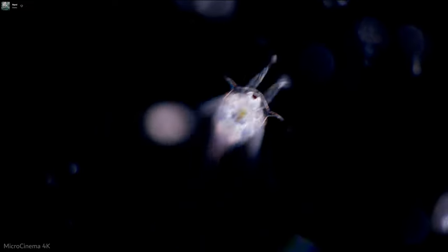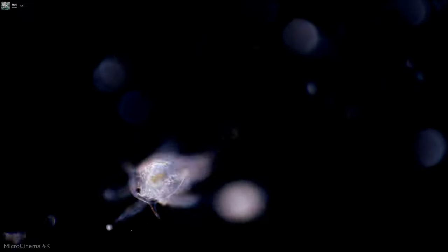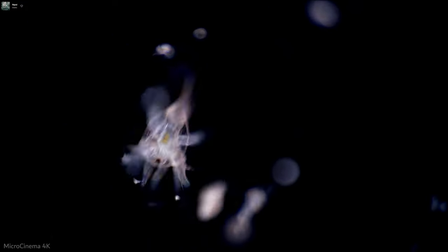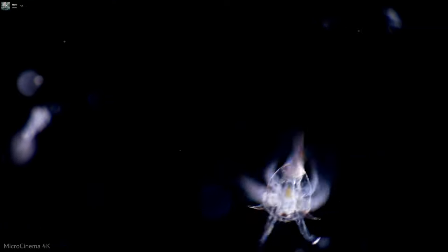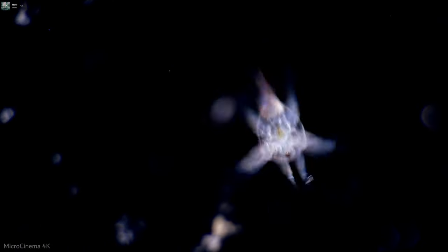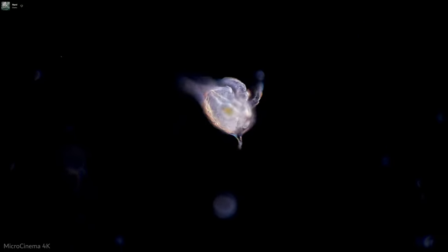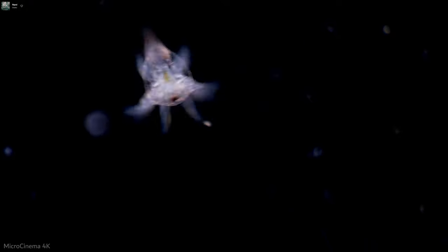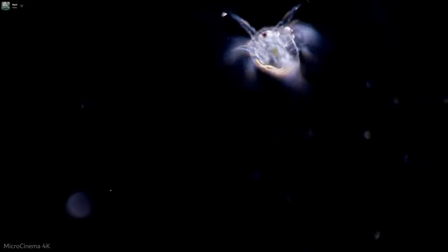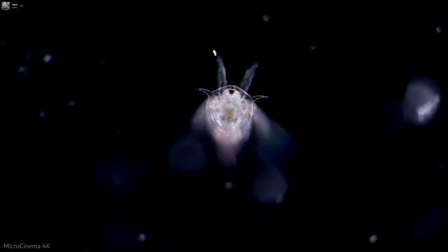And I'll just do that for a while. And I suspect that whatever organisms I was picking up just don't like being exposed for that long. Maybe the water evaporates and the salinity shoots up or something like that. So with this one, I was just really quick with it. I just popped some stuff on there and then I sealed it with the cover glass.